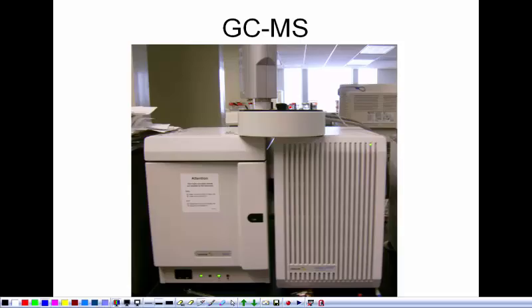What you have is you've got the GC part here, you've got the mass spectrometer part there, and then there's a tray on top that has the little robot that sucks the solution up and injects it. And just like on TV, sort of. Except on TV they get their results, spit it out in about 2 minutes. And in real life it's not that simple.